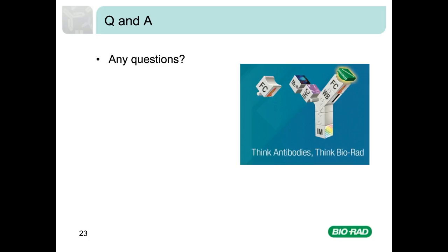For compensation samples, can I use a different antibody conjugated to the same fluorophore if my antigen of interest is of low expression? Well, yes, you can do this, with the exception of tandem dyes. The problem here is the degree of initial conjugation and the breakdown over time will vary between antibodies. So the option here is to use beads.